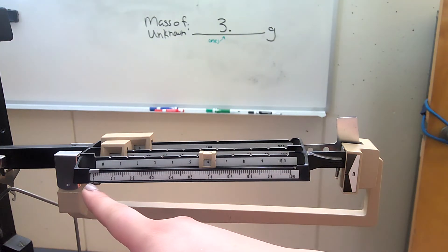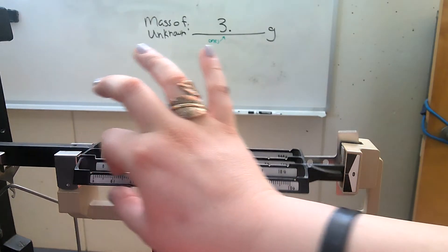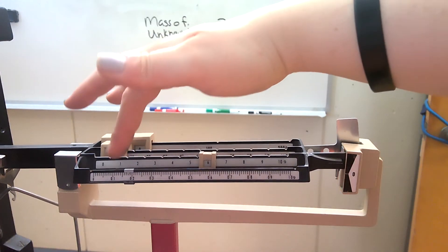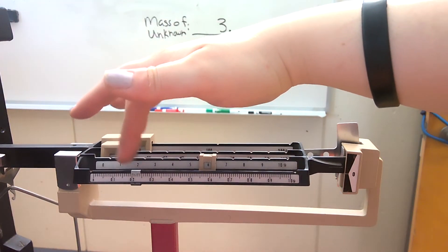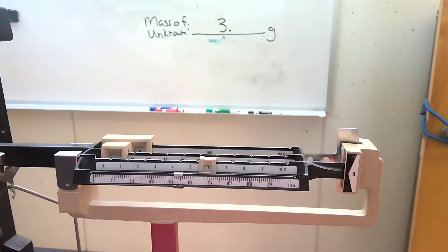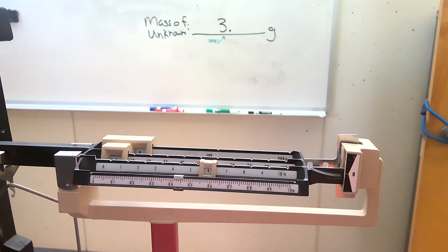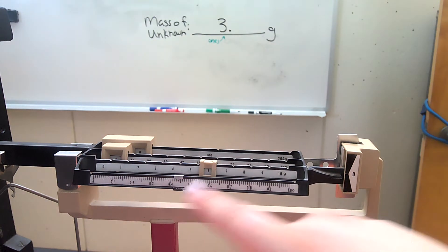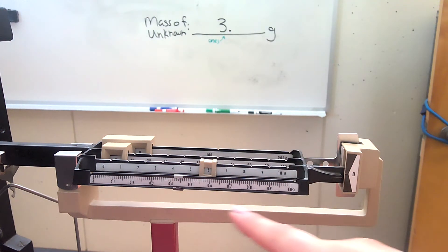So this is where you're going to move this rider very patiently and slowly because you're going to get to the very precise measurement of this. So I'm going to keep going. So I went past four and that went down past the zero, so that means this is too heavy.